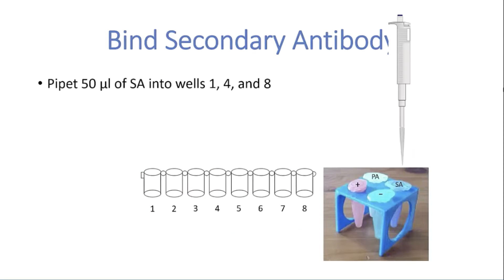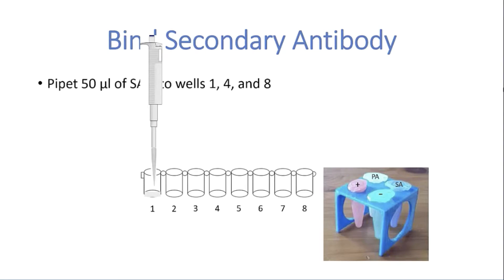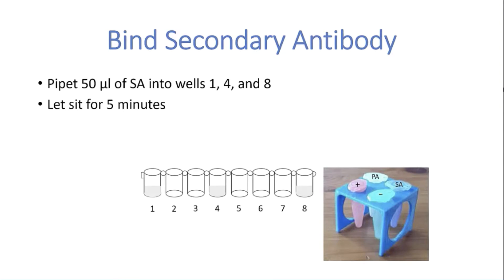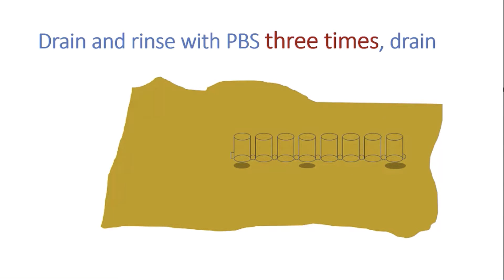Now the secondary antibody is added. 50 µL of secondary antibody is pipetted into wells number 1, 4, and 8 and allowed to sit for 5 minutes. The ELISA strip is drained again and rinsed 3 times with phosphate buffered saline to ensure that as much of the unbound secondary antibody is removed from the wells. The strip is drained again on a dry piece of paper towel.